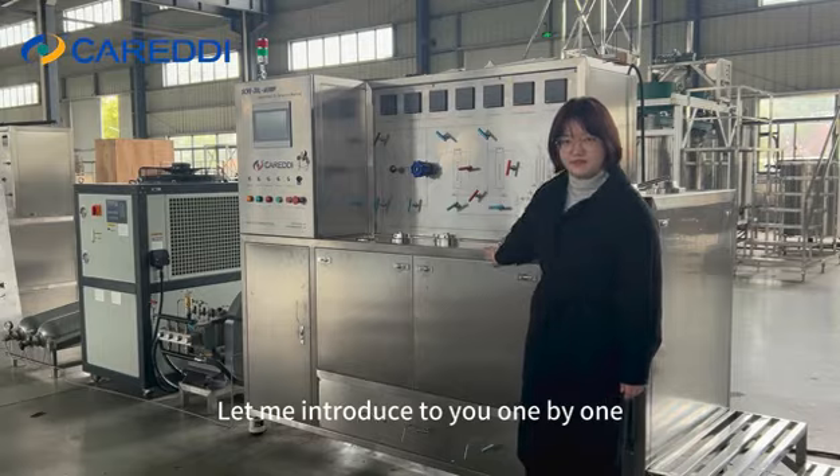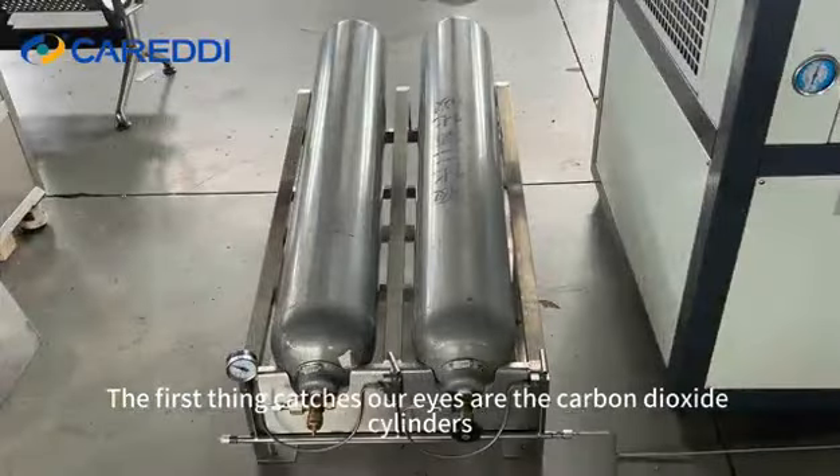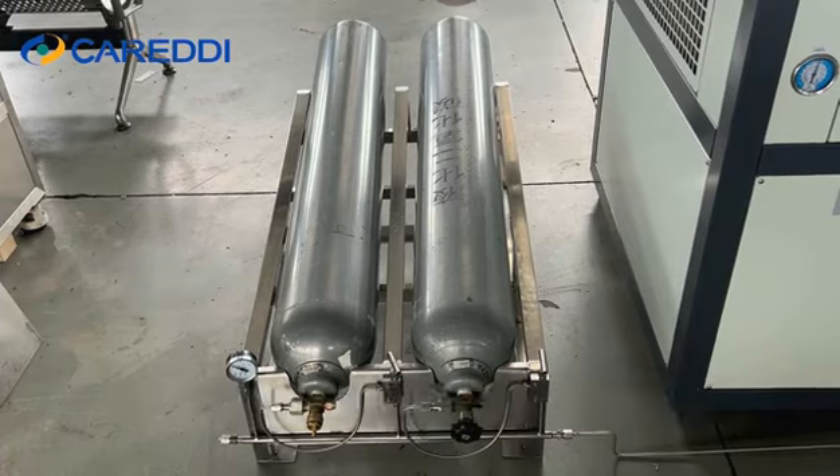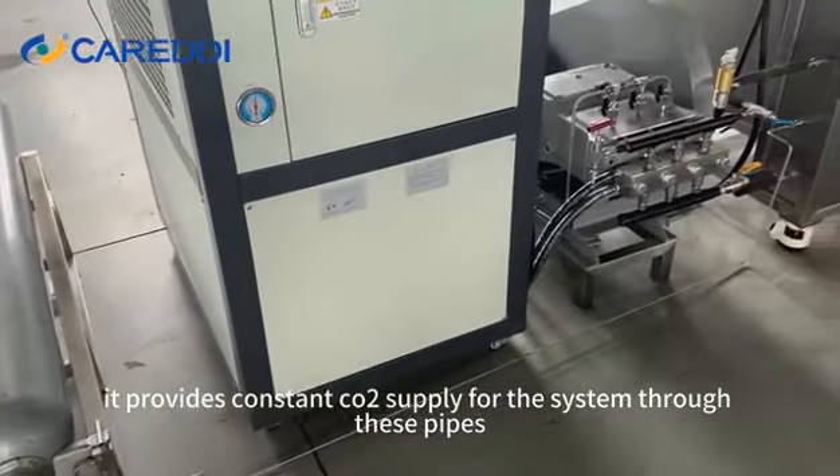Let me introduce to you one by one. From left to right, the first thing that catches our eyes are the carbon dioxide cylinders. They provide a constant CO2 supply for the system through these pipes.